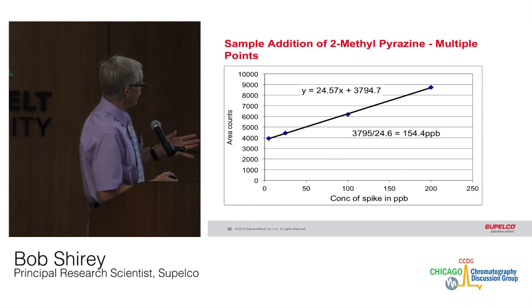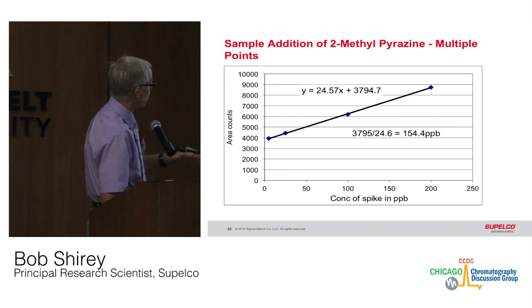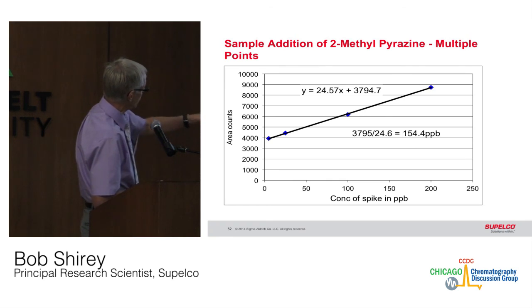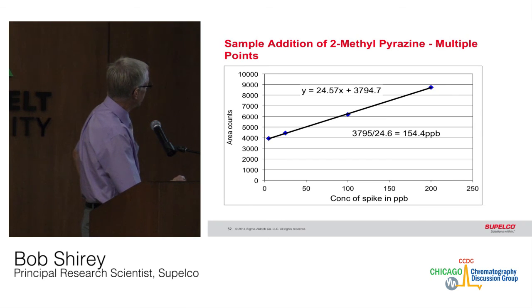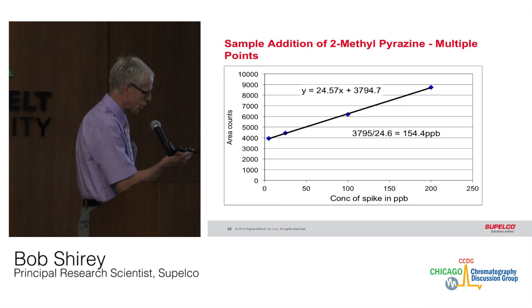Another way of doing that is to do multiple vials of the same sample and spike at different levels with the components of interest. And then you would draw your calibration curve, response versus concentration. And at the y-intercept, this is the amount that was in your original sample. We calculated that, dividing that number by the slope of the line, and you can see we get 154.4 with multiple point addition versus 158. So essentially the same.